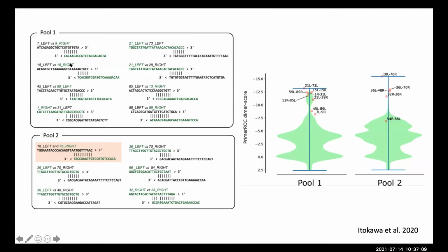So you can have interactions between primers that occur in the middle, or occur near one end, and they can be very, very stable in the sense of their annealing temperature, but they don't seem to matter unless they have a three prime exact match, and all of these are basically like that. You can see that there's one down here where you have a mismatch that's one base away from the three prime end, but ultimately all of them share this in common.